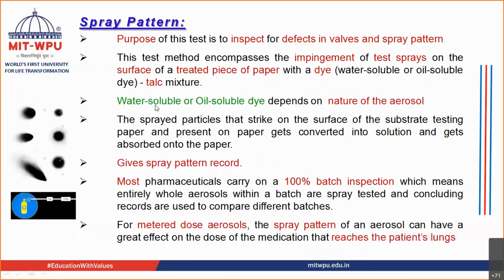The second test that you carry out is the spray pattern. Now, if you remember, I have told you the spray pattern usually is tested on the container. If you remember when I was talking about the manufacturing, each and every container is subjected to a leak test, and each and every container is subjected to spraying. Okay, this spraying usually serves two purposes. First, it determines the pattern of the spray. So these are the different patterns in which the spray is happening.